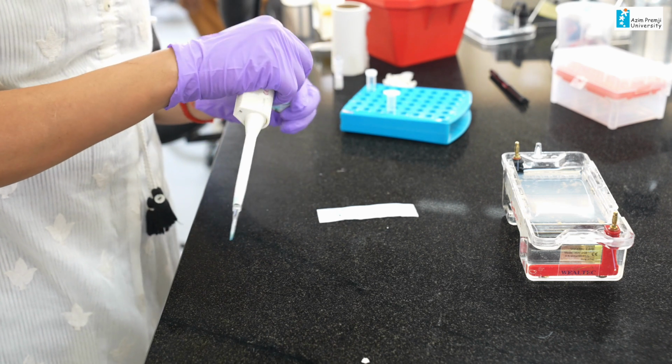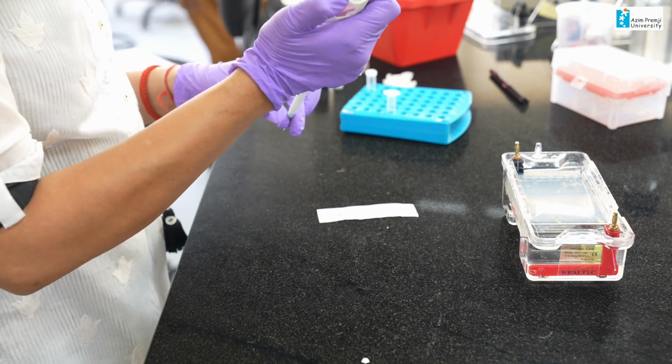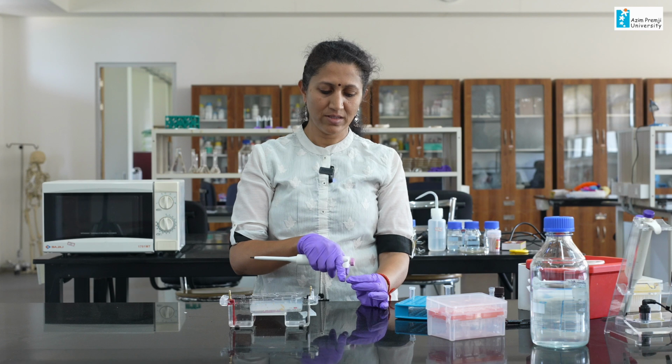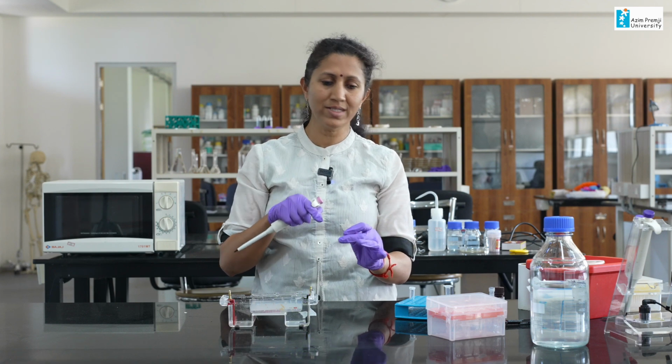And then add the DNA into it. Here is the PCR amplified DNA. We just kept it in the machine, if you remember, and it took around 3 hours to complete the cycle, and this is now our amplified DNA. I am going to add this DNA sample into the dye which I have taken and mix it, and then transfer it into the gel.